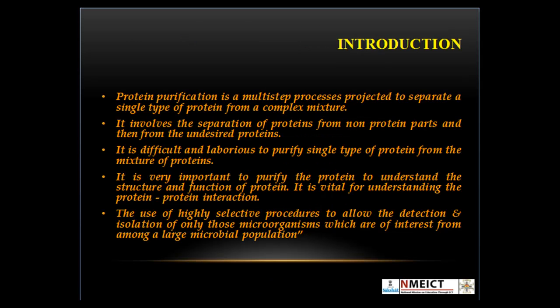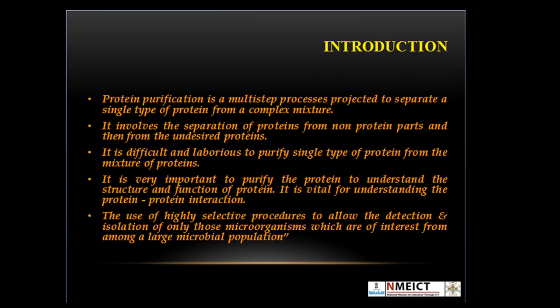Protein purification is a multi-step process projected to separate a single type of protein from a complex mixture. It involves the separation of protein from non-protein parts and then from the undesired proteins. It is difficult and laborious to purify a single type of protein from a mixture of proteins. It is very important to purify the protein to understand the structure and function of proteins. It is vital for understanding protein-protein interactions.